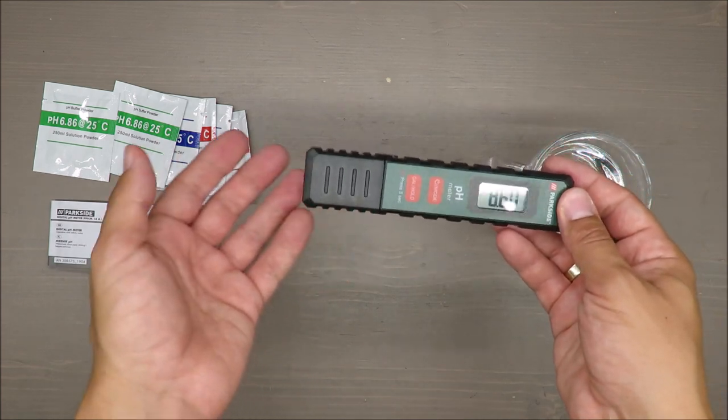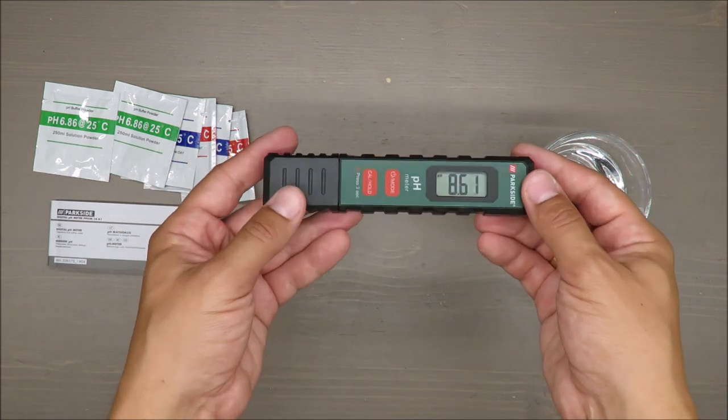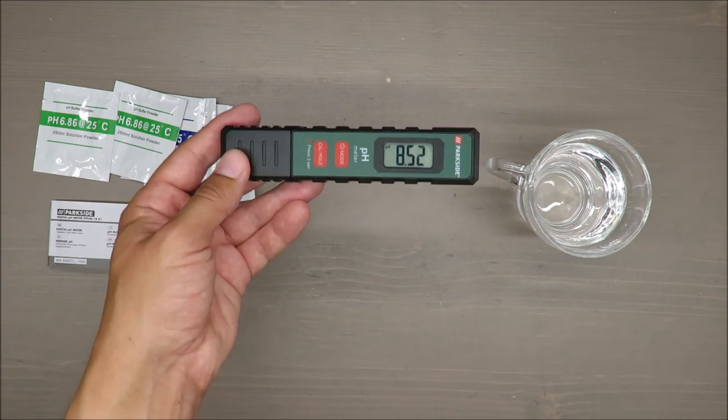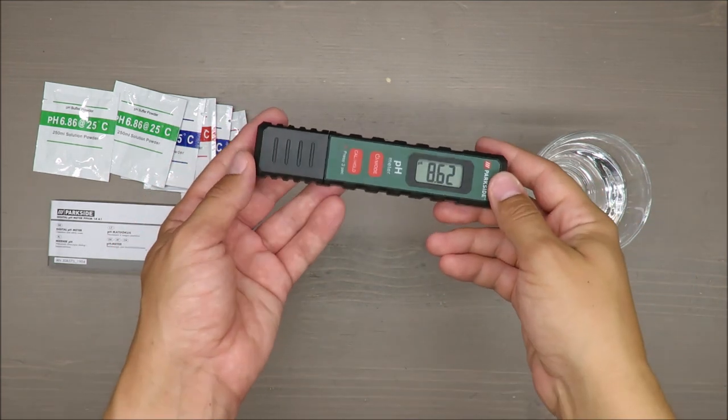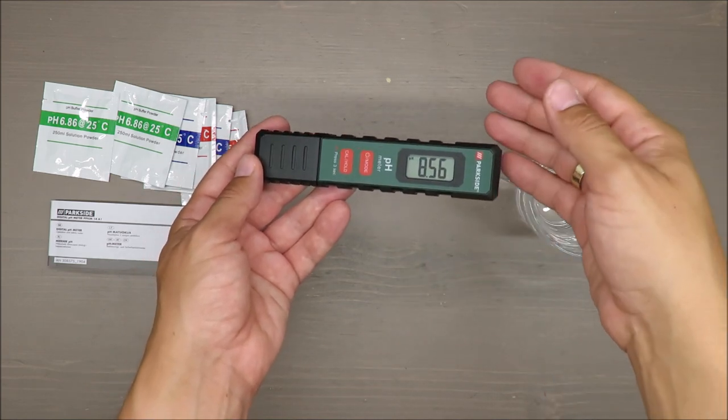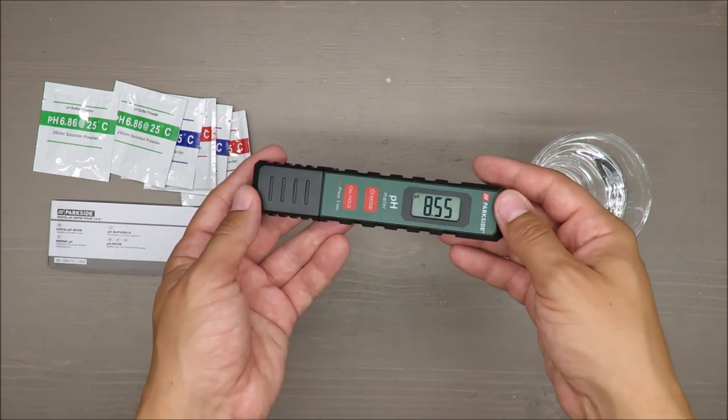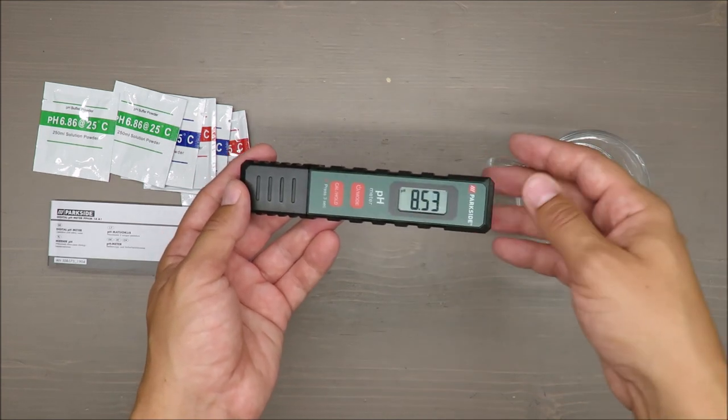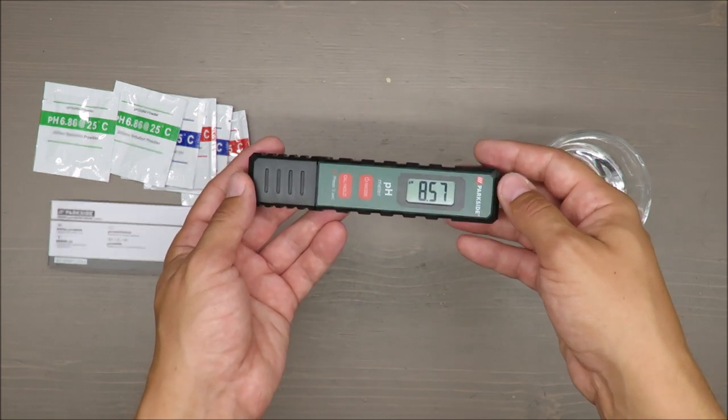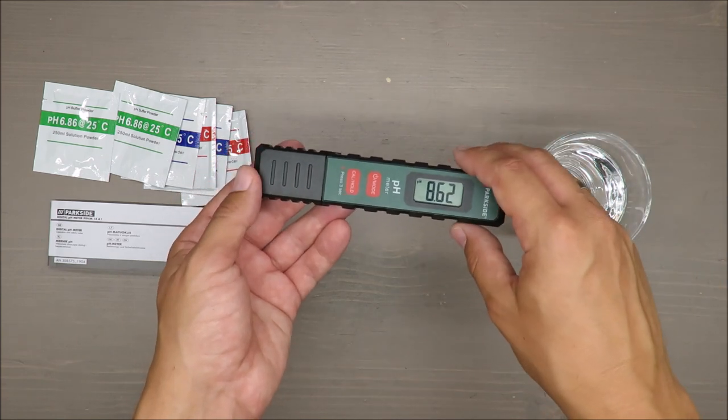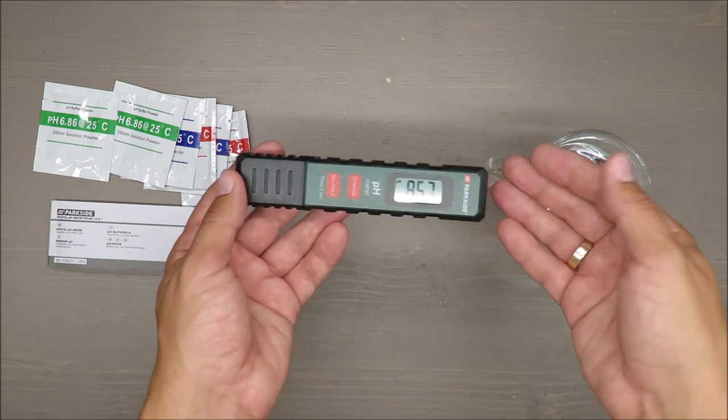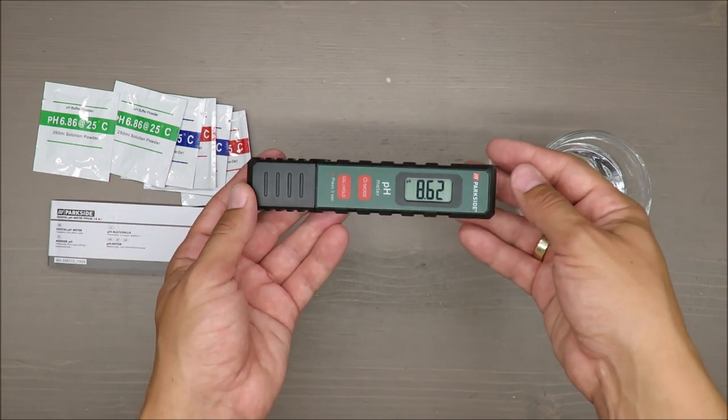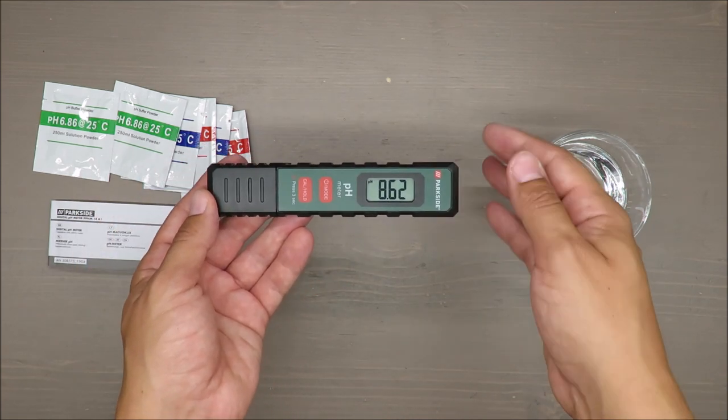This is what it is. For other fluids that you are consuming, I would say tea, for instance green tea, can have 6-something pH level, but others like yerba mate can go below 6. Other things like coffee, for instance, are as well below 6, 5.5 something like that.